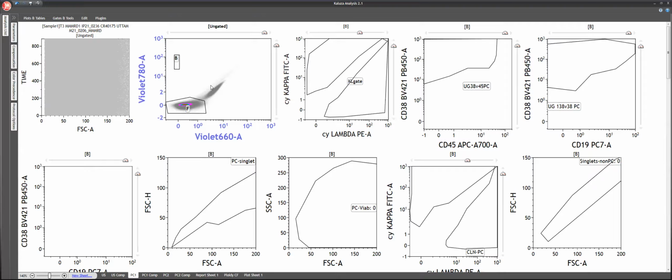for our reporting. So as we have done in earlier cases, now in multiple myeloma MRD, we have a little different approach, because we acquire millions of cells. Especially in the cytoplasmic tube, like in kappa and lambda, we see a lot of artifacts and debris which can give non-specific signals as well as junk, which can interfere with the analysis. So here we have adapted a different strategy. Now, what is that different strategy? I will explain it in a minute.